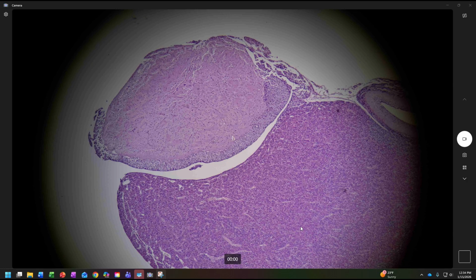One of the things you should understand is that most, and I'm not a pathologist by any stretch of the imagination, but most glandular structures have a grainy appearance to them. And we're going to see that throughout the two other types of tissues we're going to look at, the pancreas and the thyroid gland.